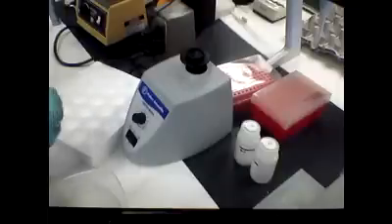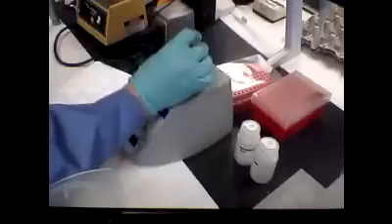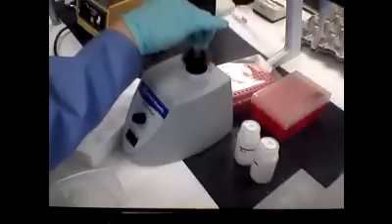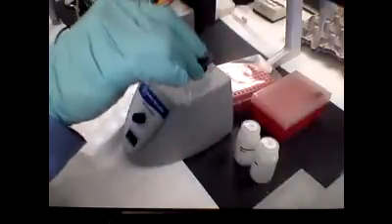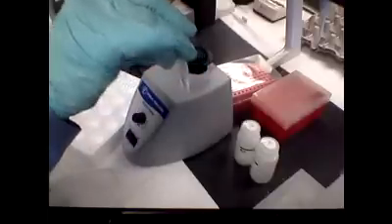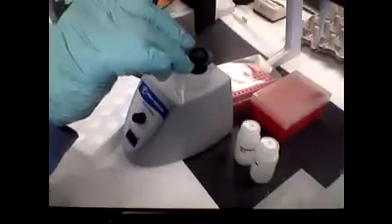This is our vortexing unit. And basically, to vortex, you just take your tube of DNA, you place it in the center like this. You see that? And then you just kind of push down, and it's going to mix your DNA, your RNA, your solution, whatever you have in here. And you want to do this during the 10 minutes that you're actually heating the agarose gel in order to melt it down to free the DNA from the agarose gel.